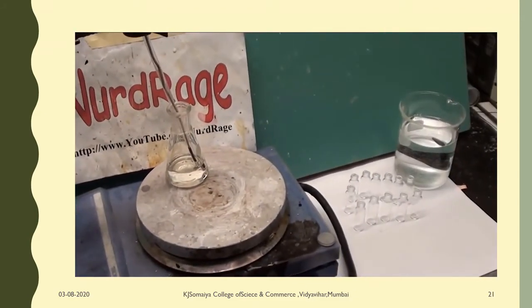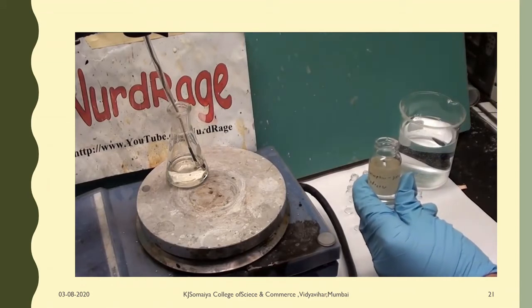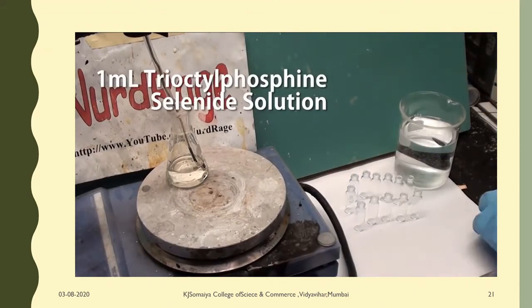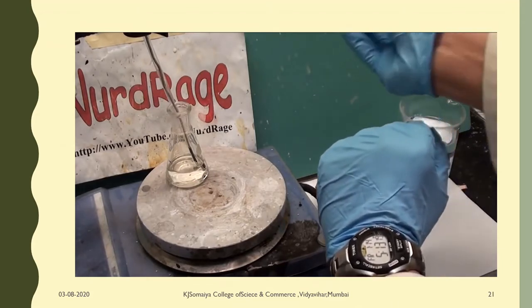While you wait, get everything set up. Have a dozen or so small vials or test tubes and prepare a syringe with 1mL of the tri-octylphosphine selenide solution from before. Be ready, because you need to work quickly.